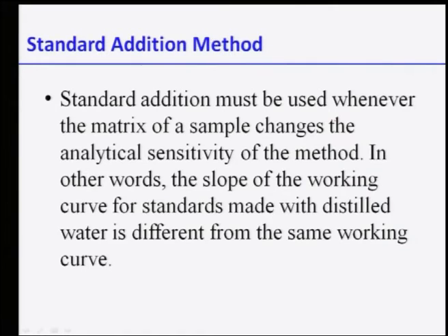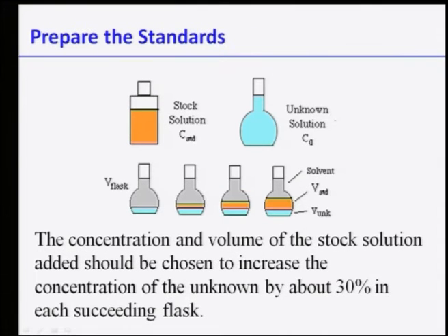The standard addition method must be used whenever you have a matrix, because you have a lot of other factors which determine the absorbance. The slope of the working curve for a standard made with distilled water is different from the working curve in the matrix. So there are many ways to prepare the standards. They can be prepared from a stock solution whose concentration is known, then you can dilute it and get different concentrations.